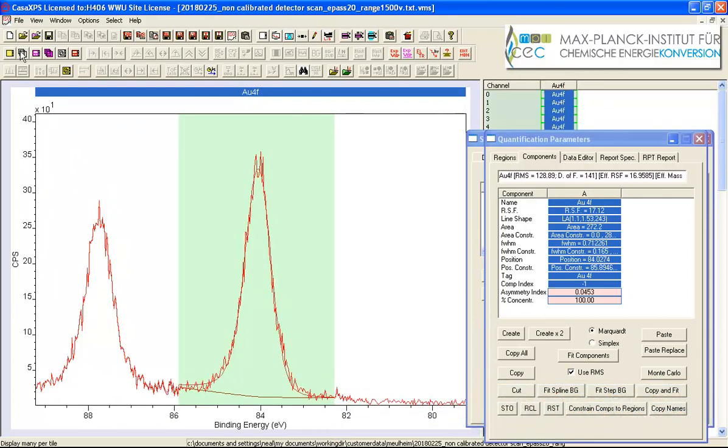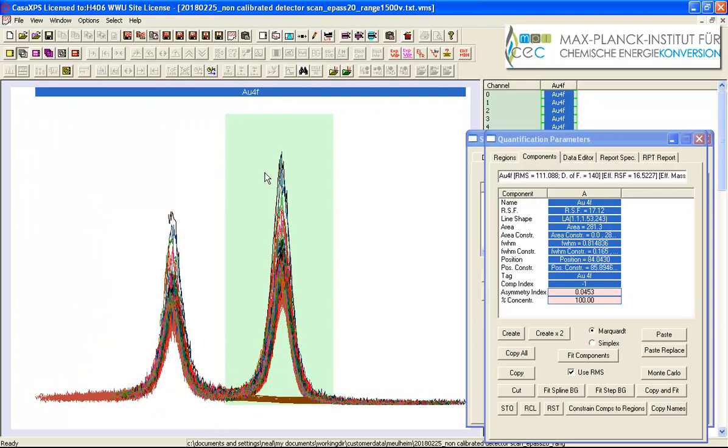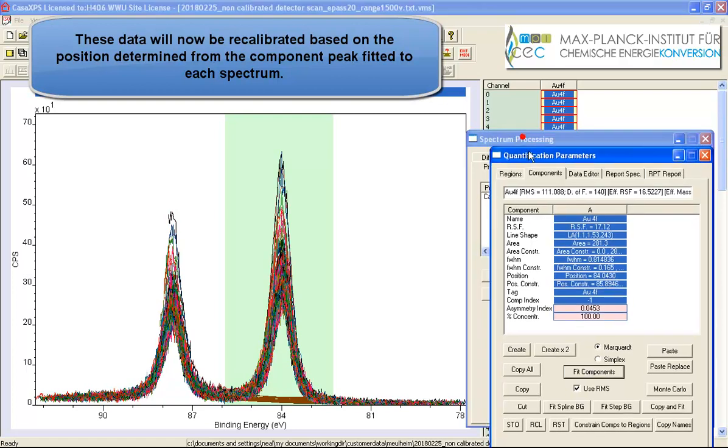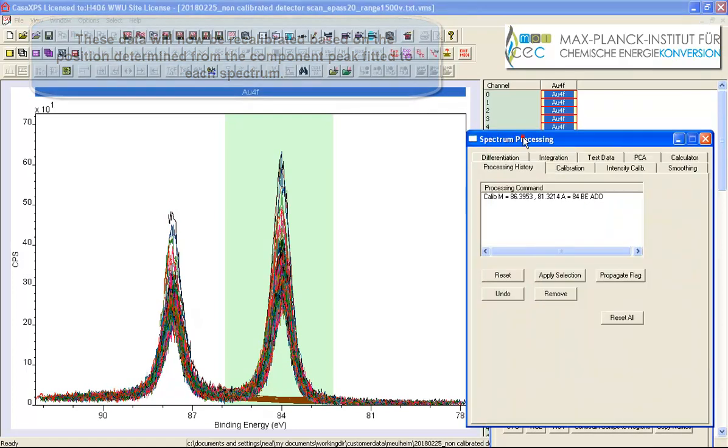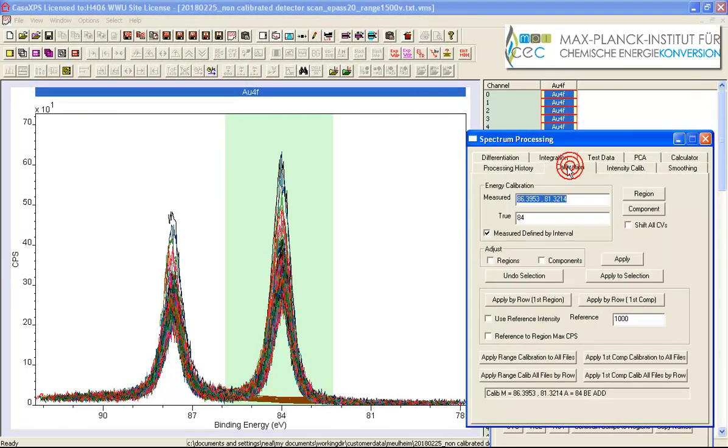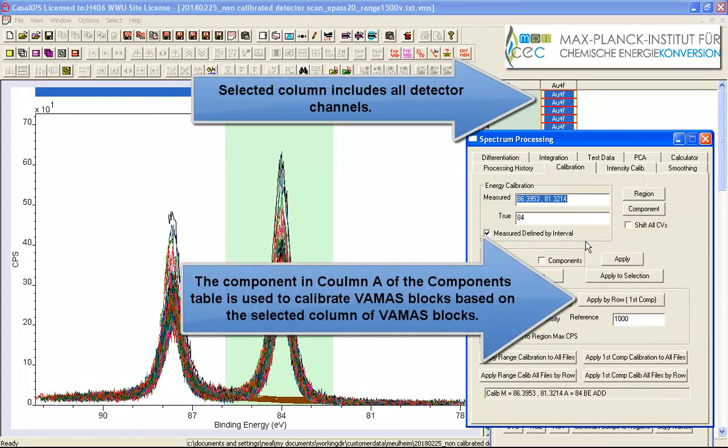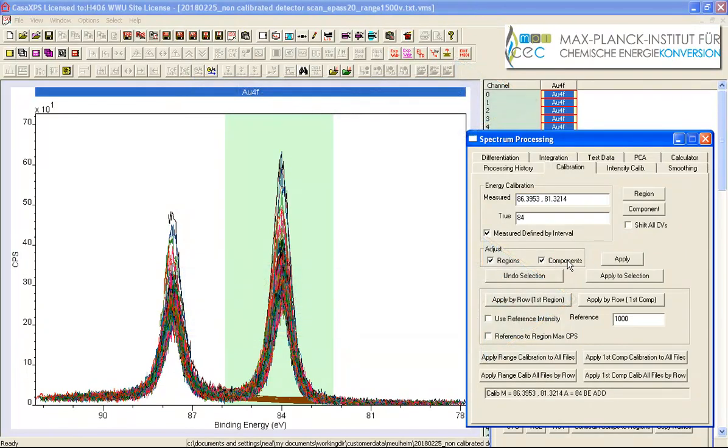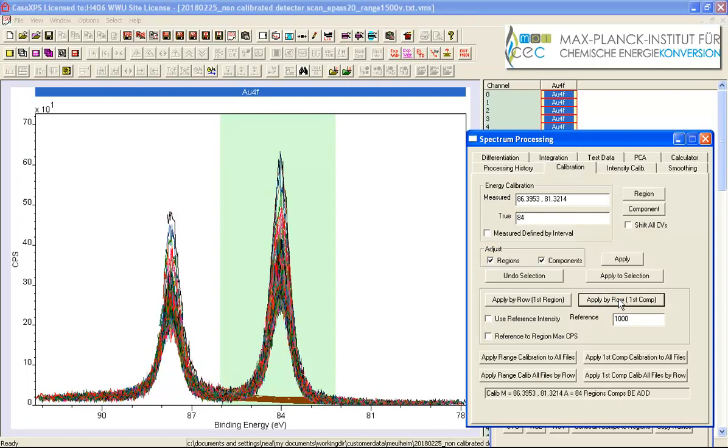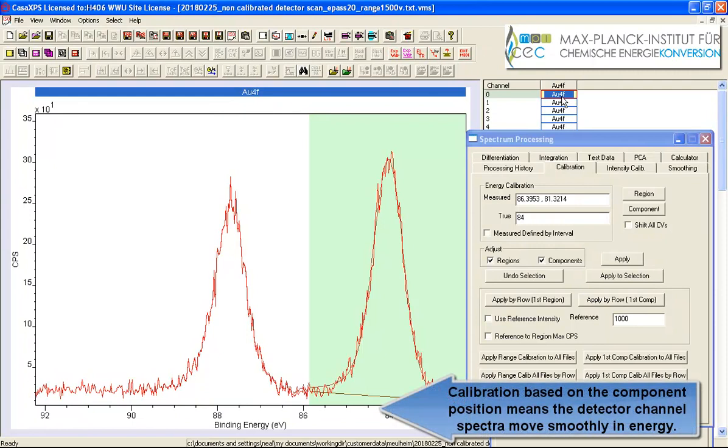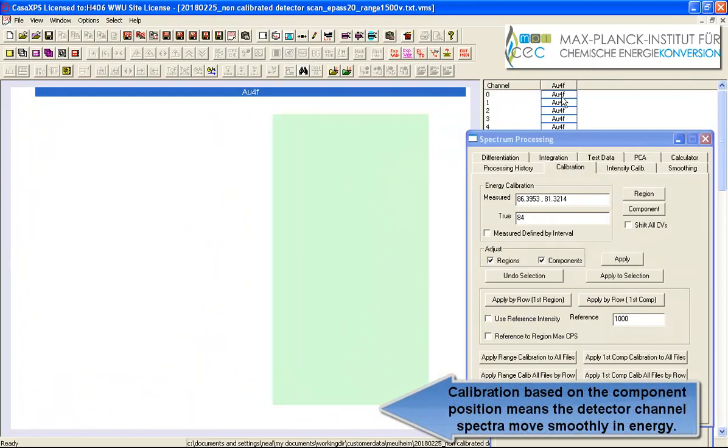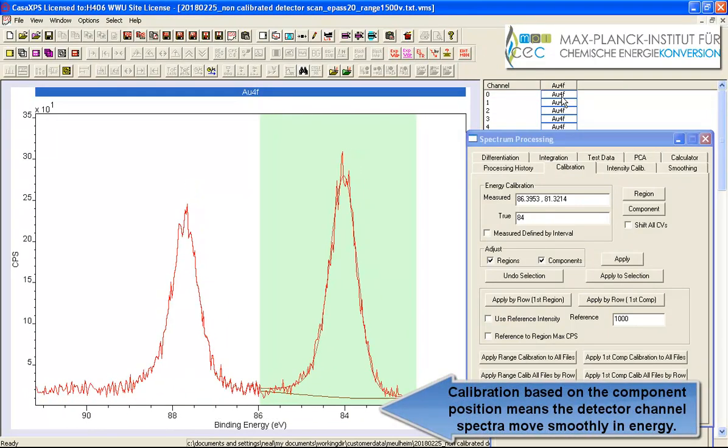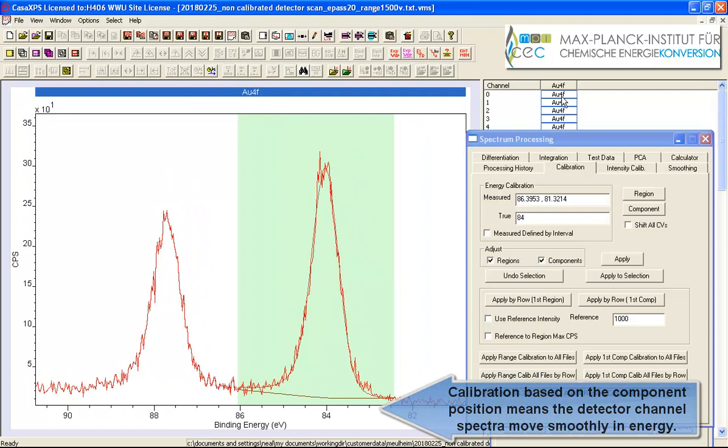What I'd like to do is rather than rely on the maximum intensity which was a bit uncertain because of the signal to noise I'm going to now use the spectrum processing calibration option and I'm going to refine the calibration by saying I'll take the region and components I'm going to use this value here and I'm going to use apply by row first component and the result of that is a more refined calibration. So if I now step through this hopefully you'll see that the scale will behave in a smoother way as I step through these data.